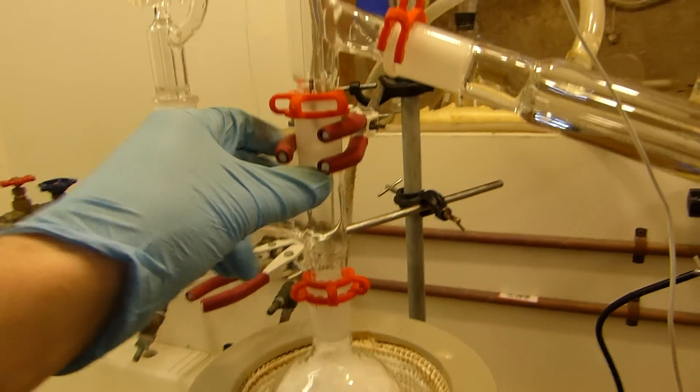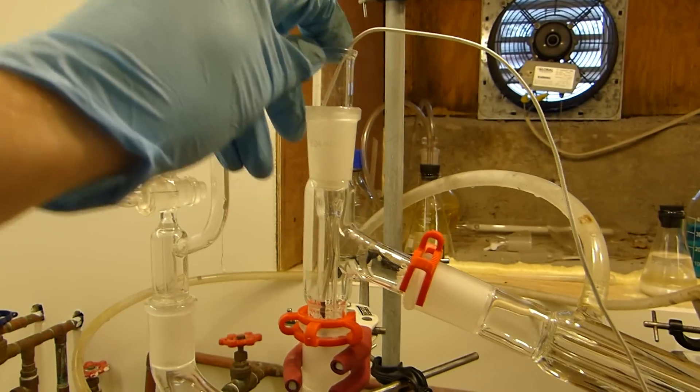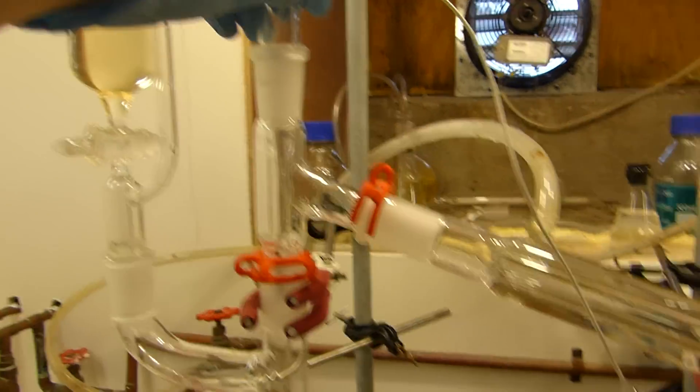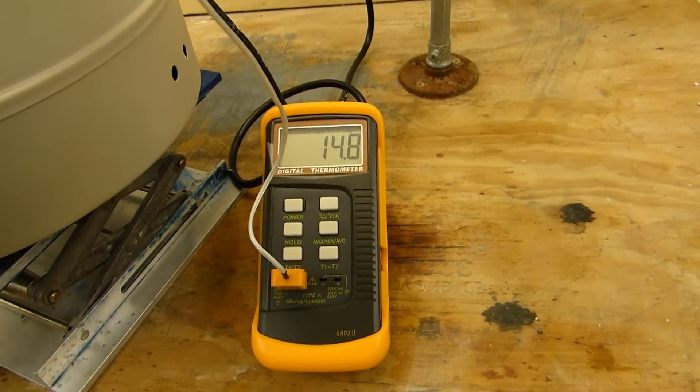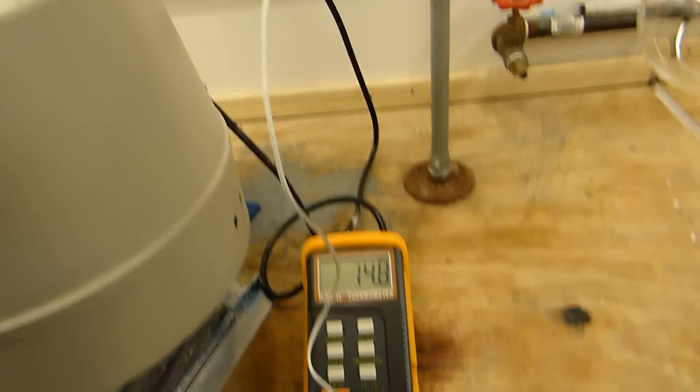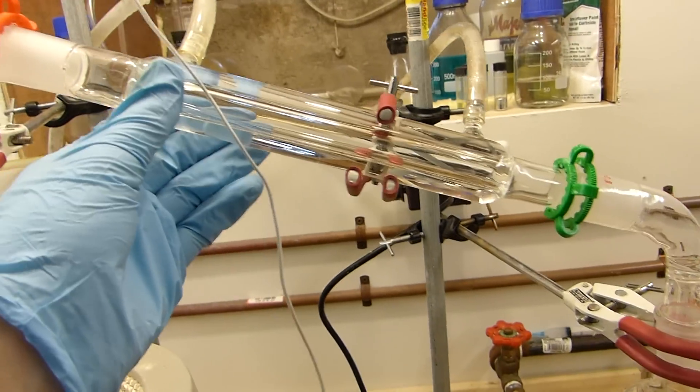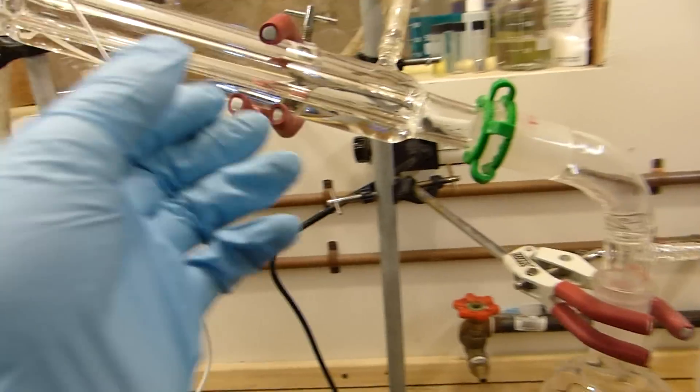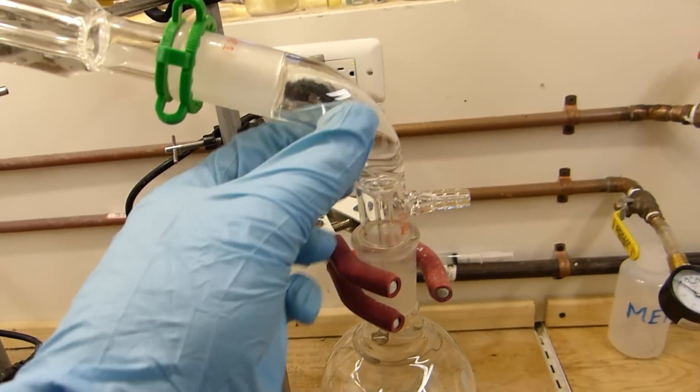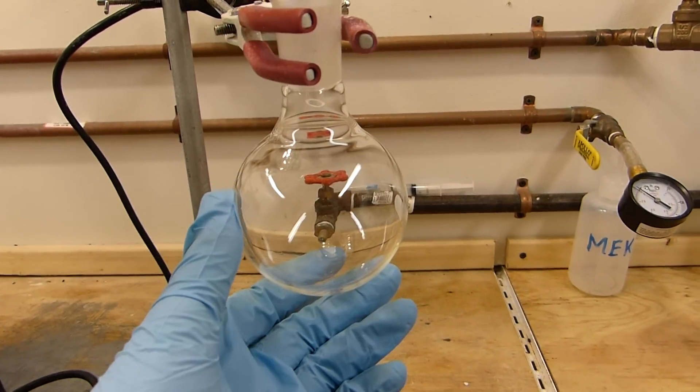And the other end of the claisen adapter, of course, is my still head, and this is just a thermal well so I can use a digital thermometer. It shows up better on camera. Let's see, we're reading about 14.8°C right now. I have a 200 millimeter liebig here with the water on, and of course my vacuum takeoff and the receiver.